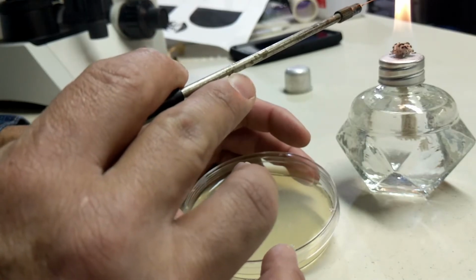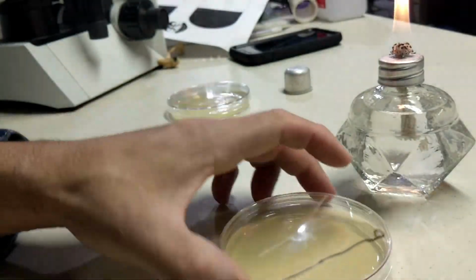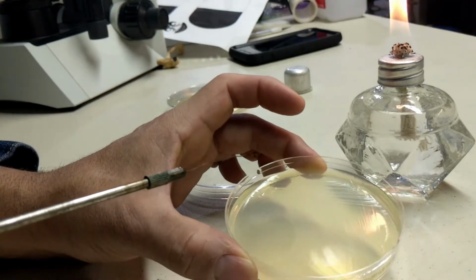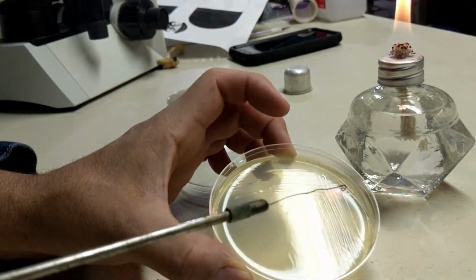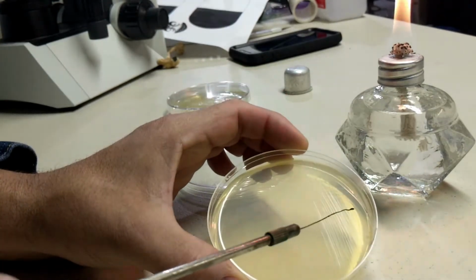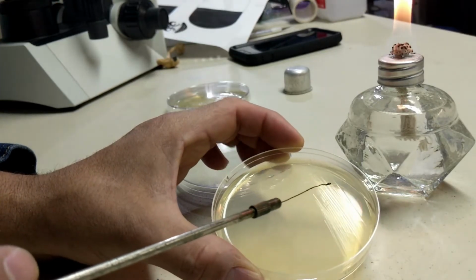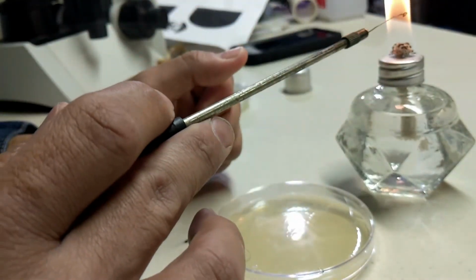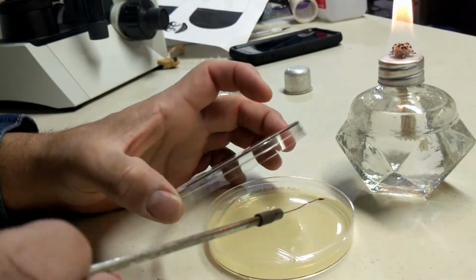And don't forget to sterilize. No, we're not spreading the bacteria. So now, let me open it that way you can see the streak. So you can see it in here, and now you have it in there. You can actually count the times that I touch this area here. So now again, close it, of course. Sterilize, then you come here to the third quadrant.